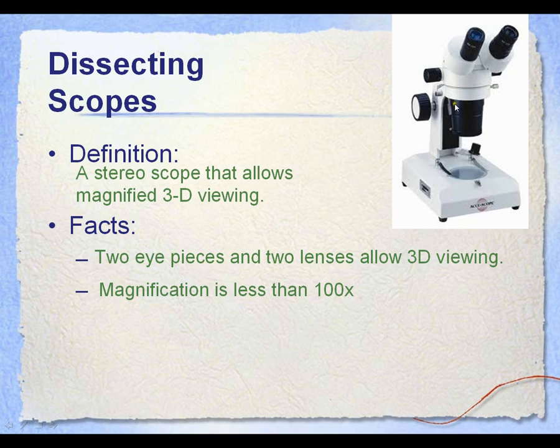Another thing to know, the light source can come from up here, so you can shine a light down on top of something if you were looking at, say, the facial features of flies, or if you were looking at the delicate wing pattern of a butterfly. You might use a dissecting scope. The nice thing about this is that the organism can be alive, and that's pretty cool.